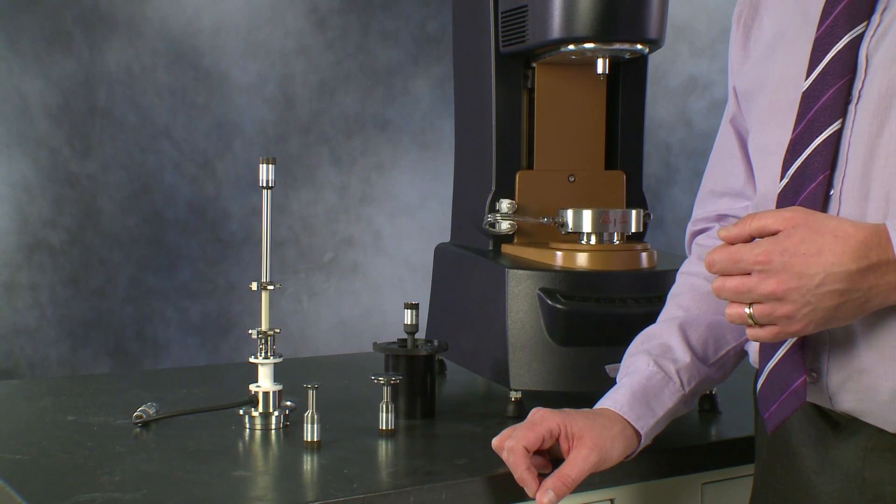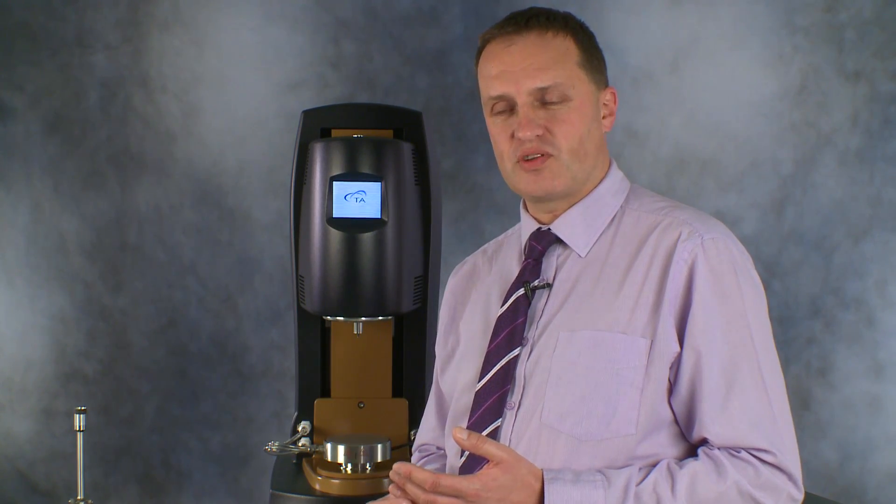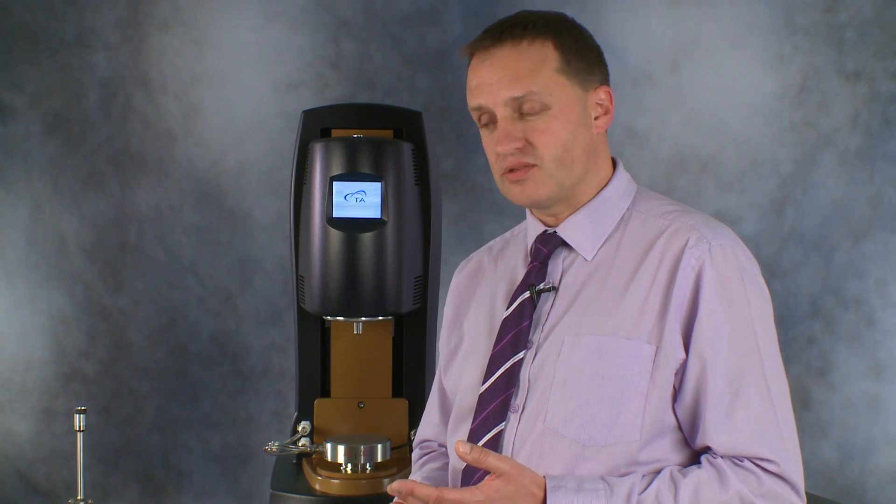Whereas hard anodized aluminium and titanium geometries have slightly lower limitations, but they also have a light density system so they are greater for oscillation experiments. Best choice.